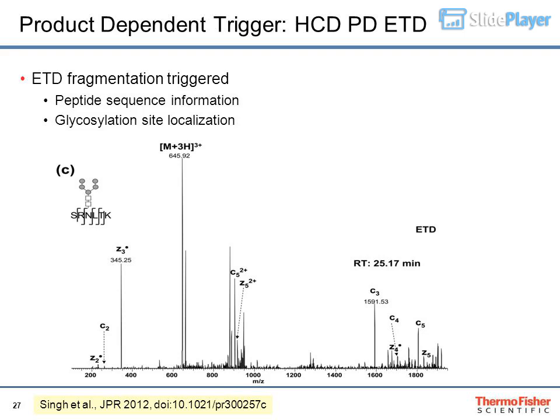ETD fragmentation triggered. Peptide sequence information. Glycosylation site localization.